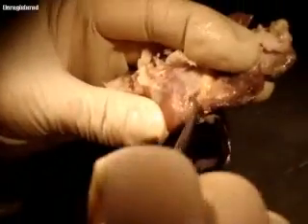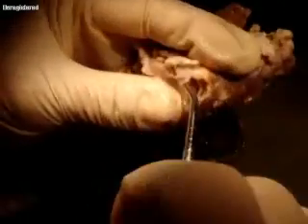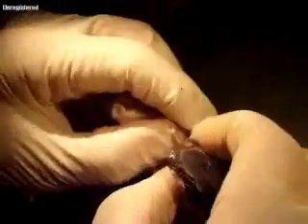Yeah. In the handbook, it doesn't necessarily say pupil, so should we just refer to that as the anterior chamber? What about the pupil? It's not labeled in the handbook, so would that be considered the anterior chamber? The anterior chamber is the area inside. The pupil is just the hole in the eye.